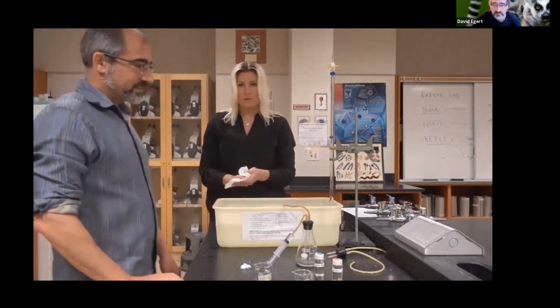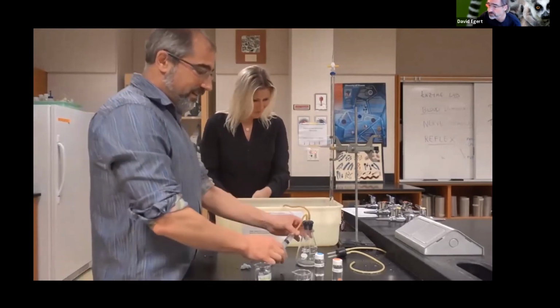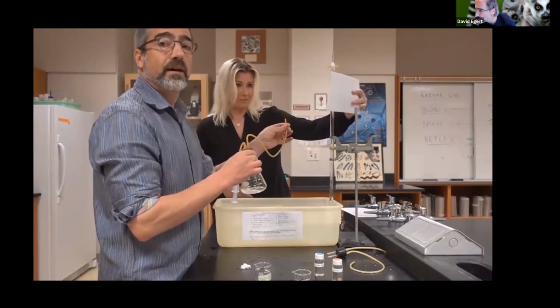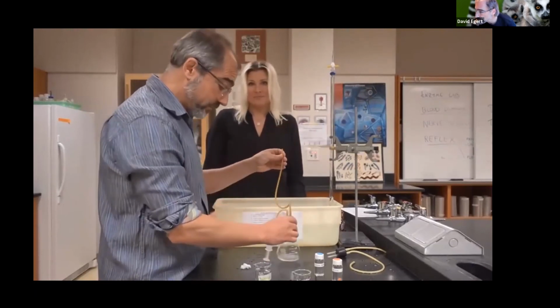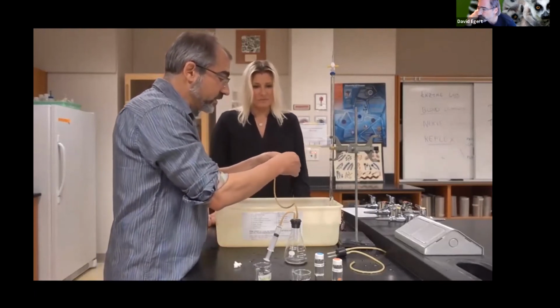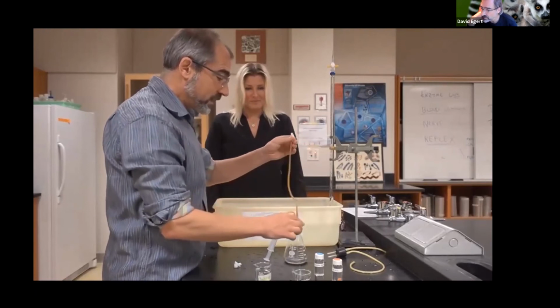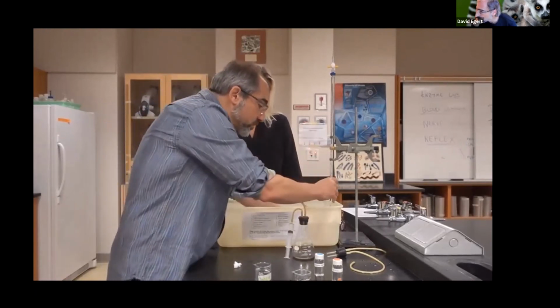All right, so we're ready to start our trial tube test experiment. Again, I have my little reaction flask ready to go. I just need to make sure that I have this tube now up in the burette so it'll capture the oxygen. So I'm going to take a little piece of gauze here. Again, we're going to see how this works to try to diffuse the bubbles a little and break them up. I'm going to take this and push it up into the tube.